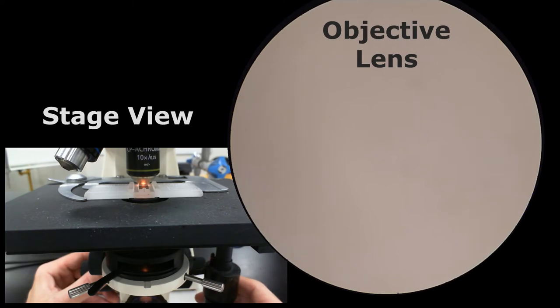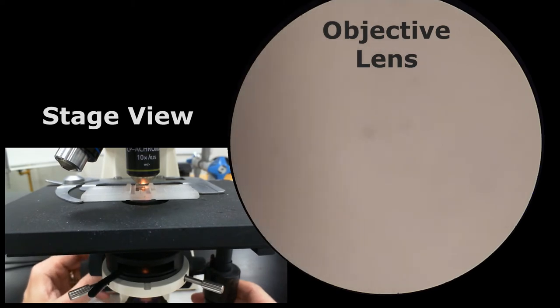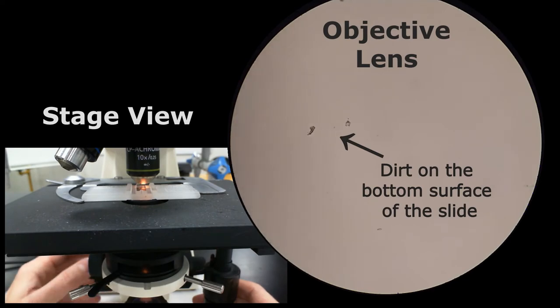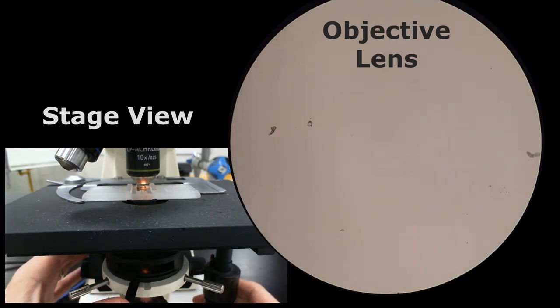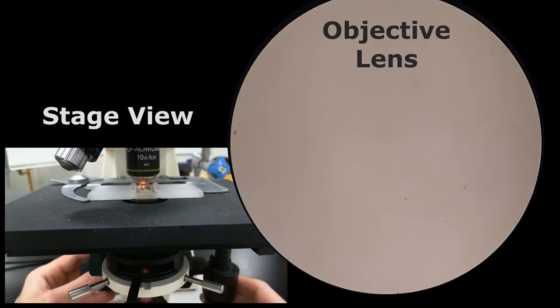I'm going to try moving my stage back and forth a little bit just so if something comes into focus, I can try to stop at that point. I can kind of see something moving about. Okay. So now I just need to find my counting area.